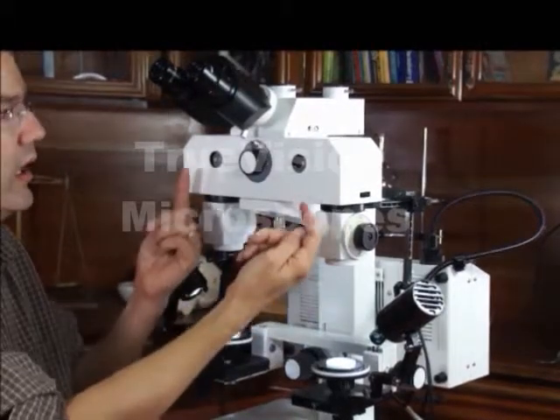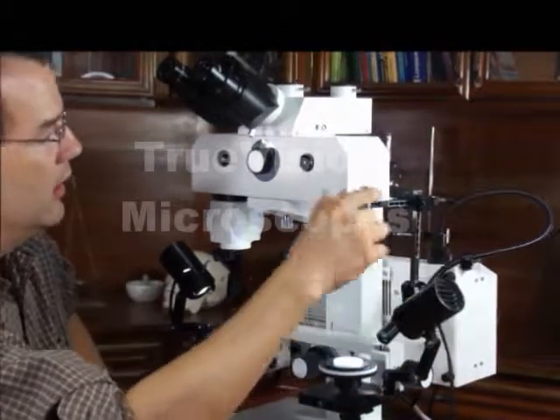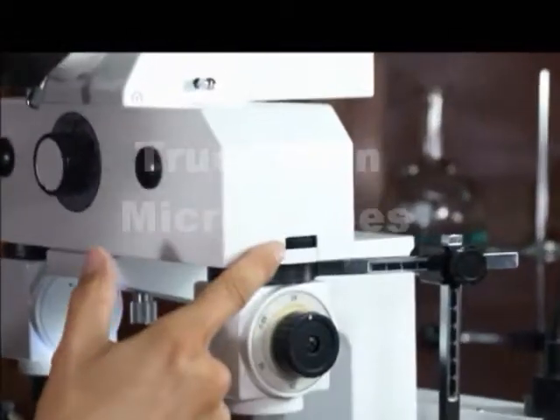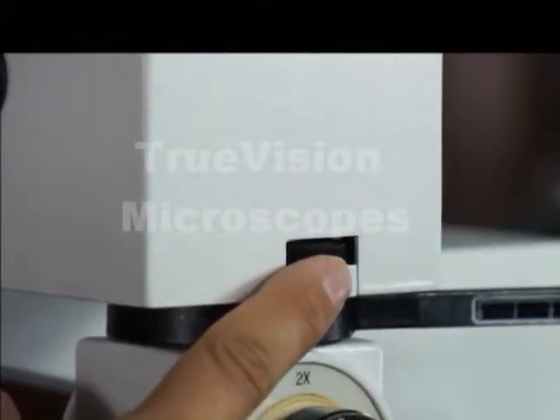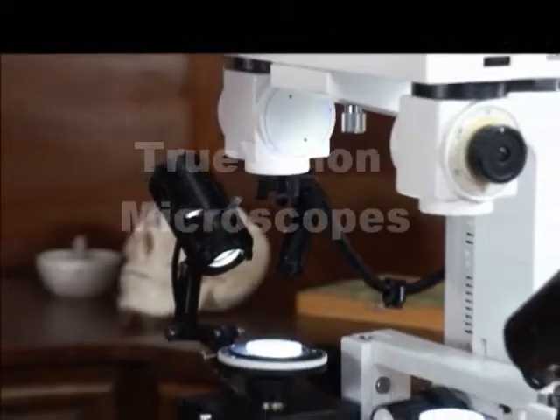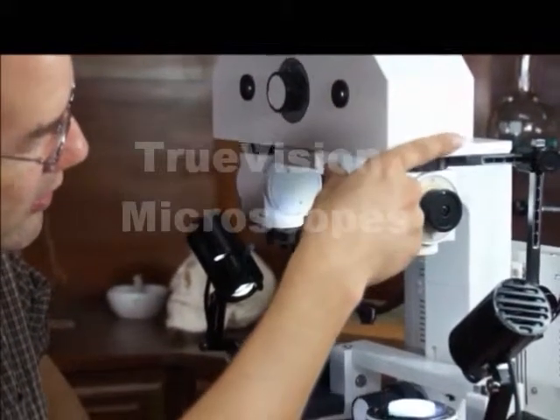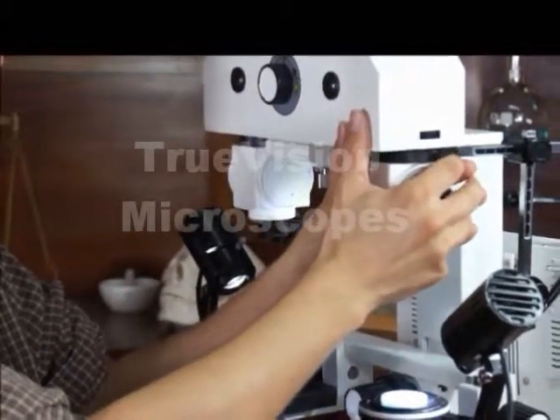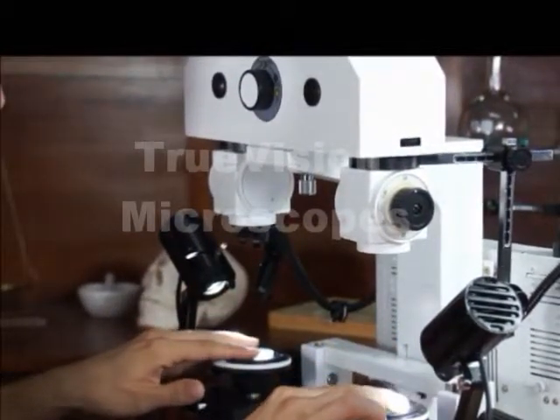Remember, you have two independent eyepaths. This knob is used to adjust the magnification to get the magnification on the left equal to the one on the right. Turning it one direction increases the magnification; turning it the other direction decreases the magnification of this side. Do that until the magnifications are equal.